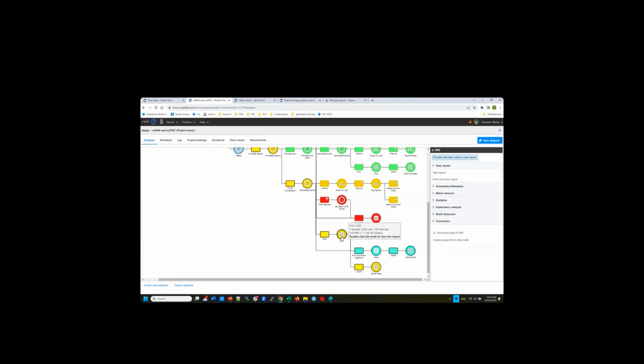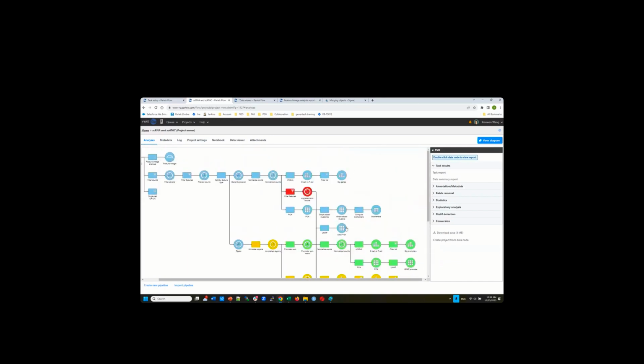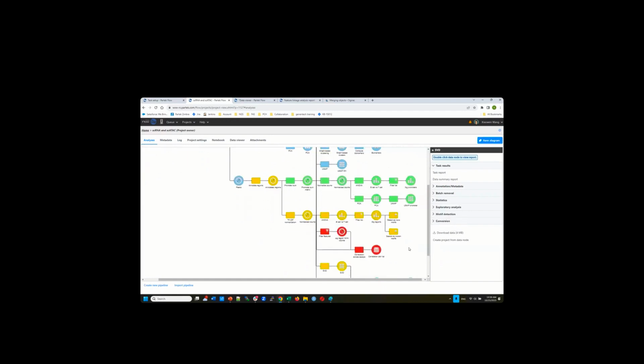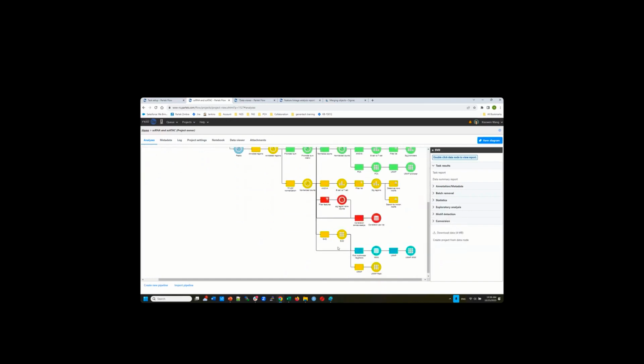You can perform Harmony on this, and you can perform UMAP and graph-based clustering on this too. So I performed the UMAP on this. You see that we have a UMAP of gene expression. Always right-click and rename it, so you know what this is. I use this green color to represent the promoter information. I have a UMAP for promoter. Also, I have a UMAP for peaks for ATAC-seq.